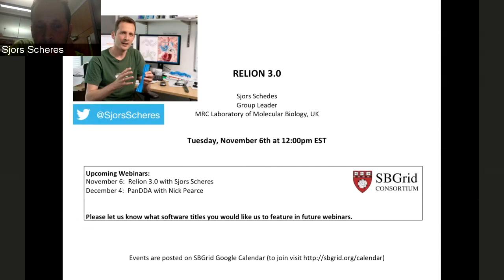There is also a new option on the particle subtraction job type, which allows you to provide the center of rotation from which you would like to do the particle subtraction. And that might allow you to then use smaller box sizes on your subtracted particles. Although that will require a little bit of scripting around some of the command line programs. That's possibly not only through the GUI.